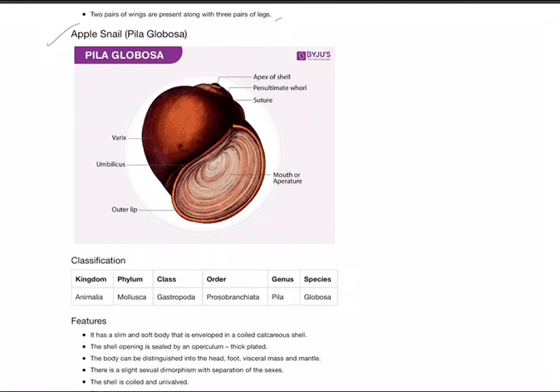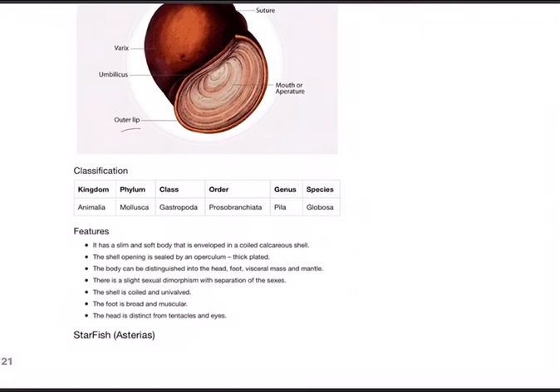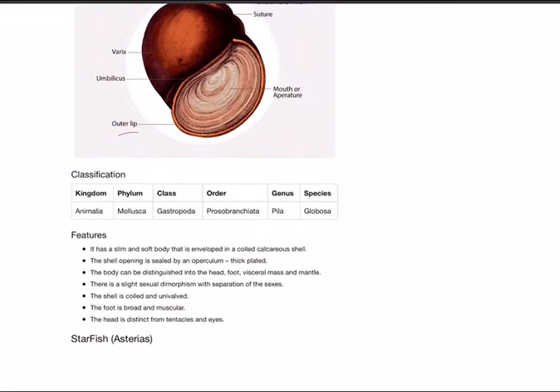Next animal: Pila globosa, apple snail. Draw the diagram showing mouth or aperture, suture, apex of shell, penultimate whorl, varix, umbilicus, and outer lip. Classification: Kingdom Animalia, Phylum Mollusca, Class Gastropoda, Order Prosobranchiata, Genus Pila, Species globosa. Features: it has a slim and soft body that is enveloped in a coiled calcareous shell.